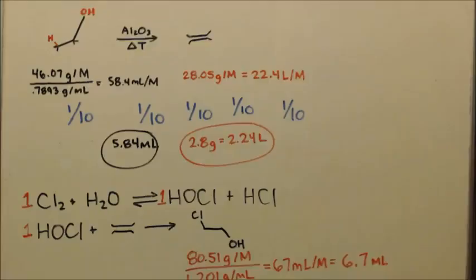Alright, I'm going to try to make some ethene today. In the beginning, in my first couple of videos, I made propene from isopropyl alcohol, and I'm going to make it the same way I did there, with aluminum oxide as the dehydrator. It's basically a catalyst, you know what I mean? It doesn't get used up, theoretically.